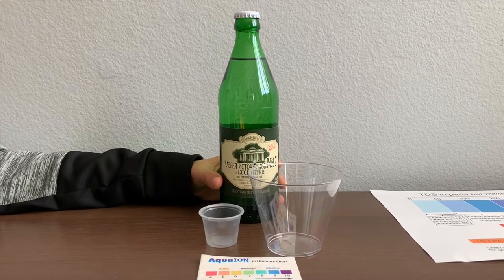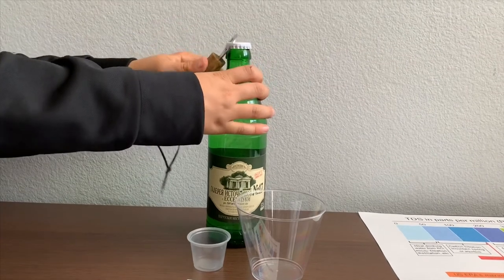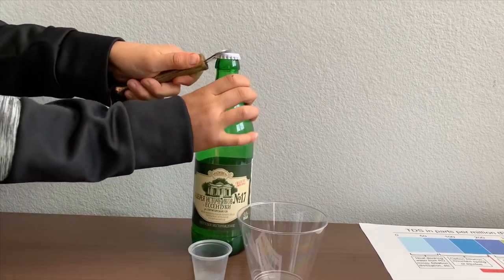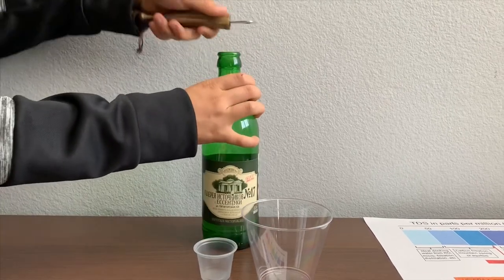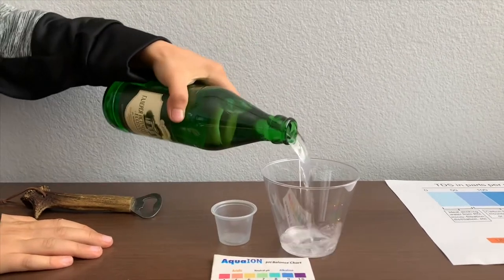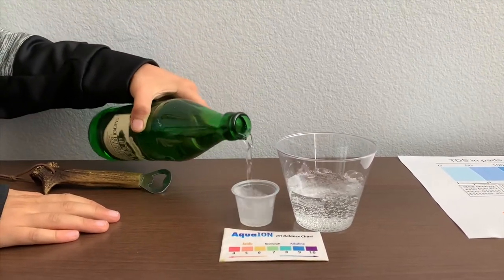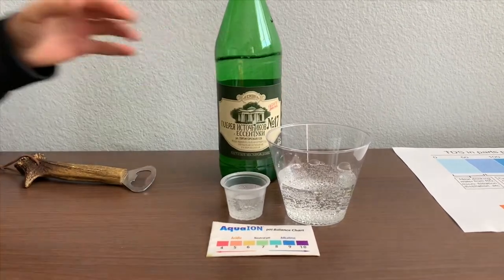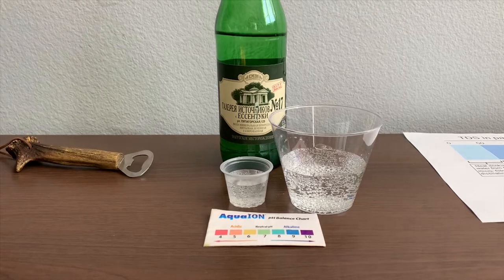Let's test the pH and TDS levels. First, let's test the TDS levels. Let's pour some water in. Let's stir it a little for a better result.